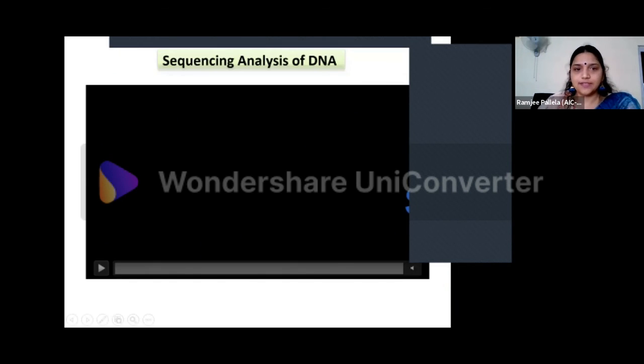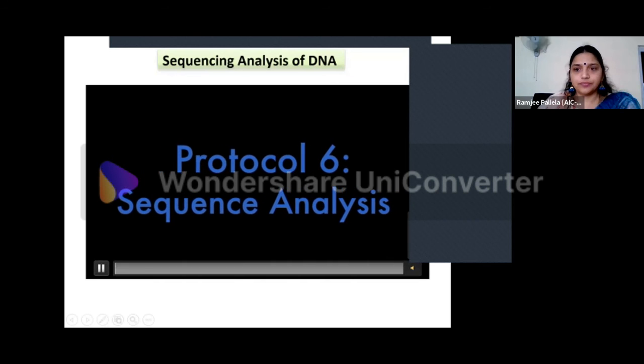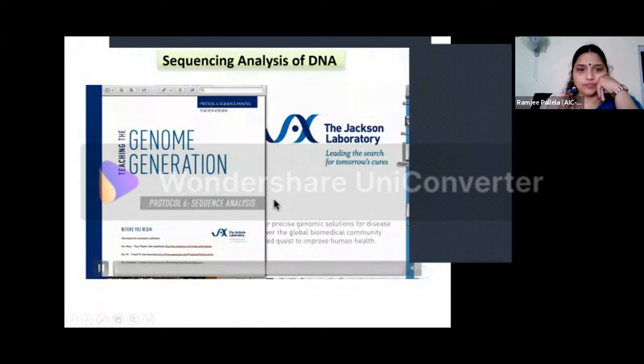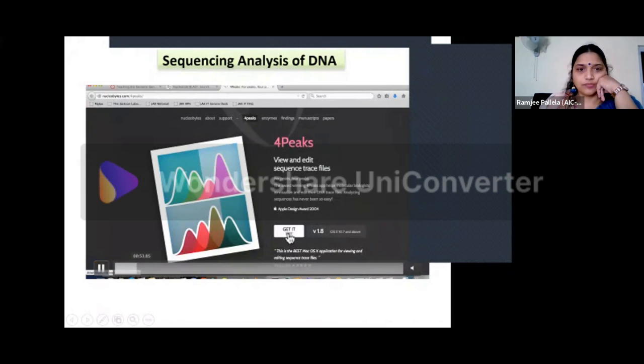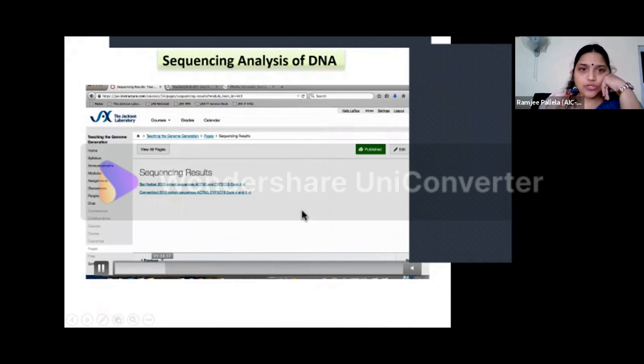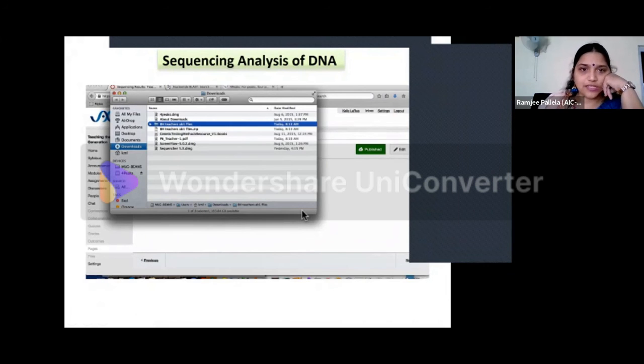Now, how do we actually do the sequencing? I'll just show you a video for that. This is how the sequencer actually looks. Okay, so all these things you have to actually change in the sequencer. So what is ABI? ABI is the company which is generally providing the sequencers to most of the labs. So we are using these ABI sequencers in our labs.